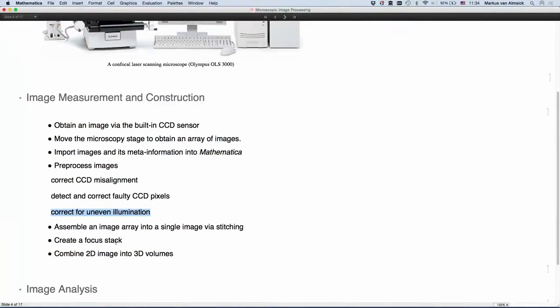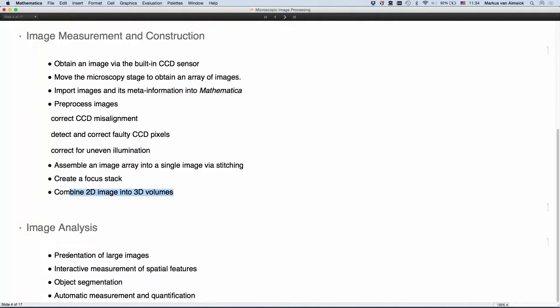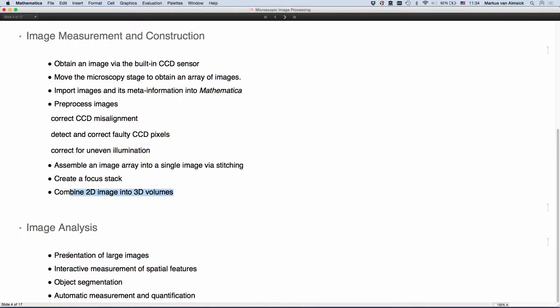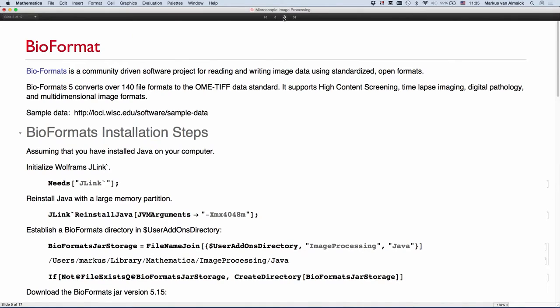And then, as I mentioned, you have to assemble images because you don't just take one image but the whole array of images. Then I have one point here which I probably can skip because Julio already talked about it, and then I'll talk quickly about how to combine 2D images in 3D volumes. Then comes the interesting part. I will show how to present large images in Mathematica with dynamic image, how you can write with the dynamic interface measurement front ends, show object segmentation, and then some automatic measurements and quantification programs.